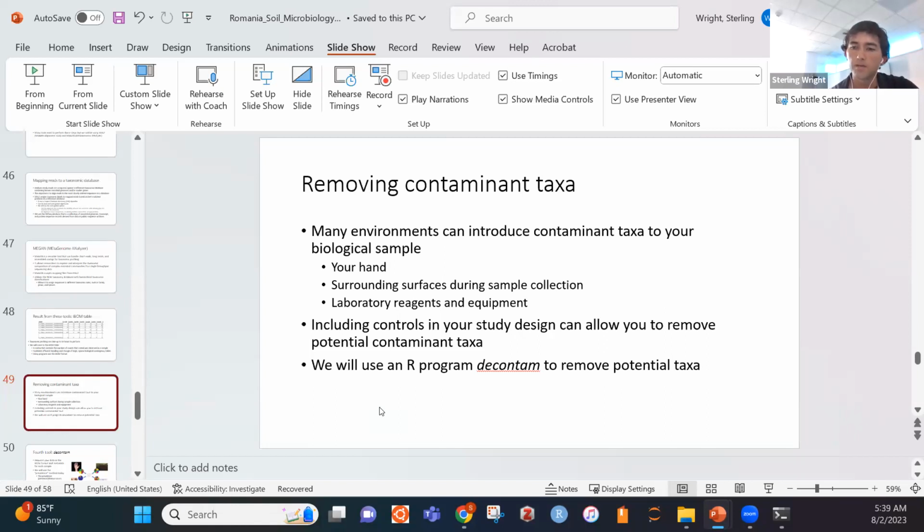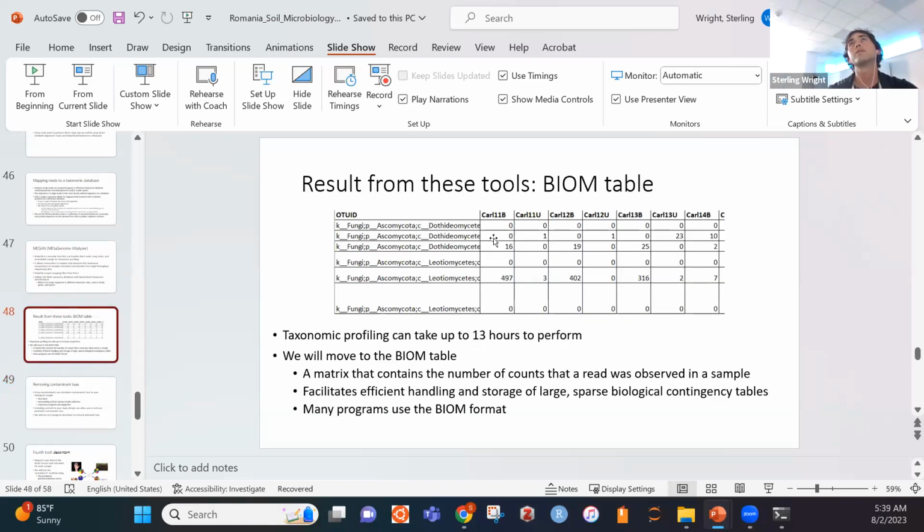So it means, say, would there be differences in counts for... and so, yeah, I would say, again, I'm not sure if I completely understand the question. So again, the counts here are the number of sequences in your sample mapping to one of these features, right? So this could be, let's say, this species, or I guess it only shows up the class here, right?